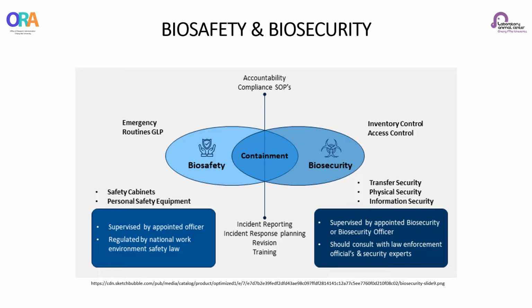The success of both programs hinges on a laboratory culture that understands and accepts the rationale for biosafety and laboratory biosecurity programs and the corresponding management oversight. Also, laboratory biosecurity and biosafety programs may have many similar components. They may also have some conflicts. In some cases, laboratory biosecurity practices may conflict with biosafety practices, requiring personnel and management to devise policies that accommodate both sets of objectives.